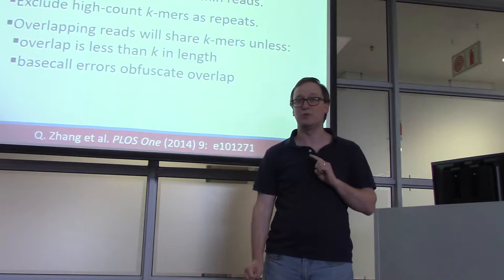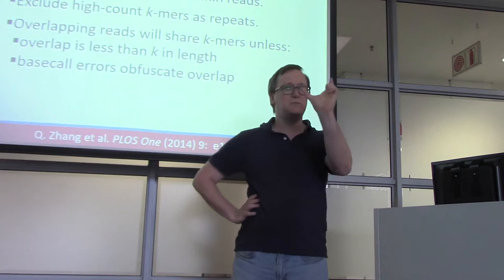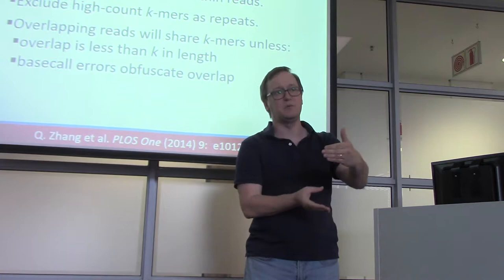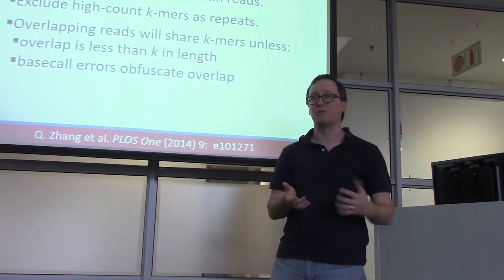So if you have a sequence that is a very, very common feature of the genome, like an ALU sequence, then you might have this same sequence appearing at thousands of places in the genome, thus having a really inflated count in the k-mer catalog that you've built from the sequencing reads. If so, those are going to be really big outliers. You're going to have a huge count of how many times you've seen these sequences that we know to be associated with pseudogenes or repeat regions or whatever. So just scratching all of those out is one of these steps that we're just going to take. We're just going to get rid of them.